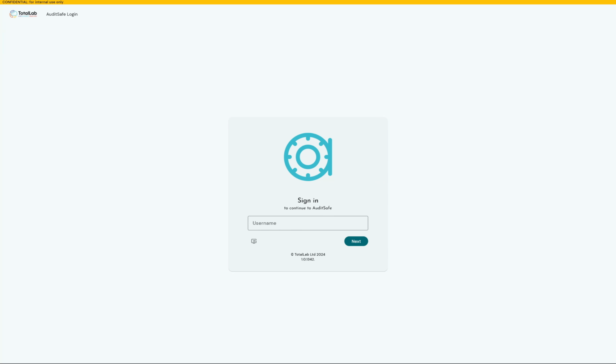As a brief theoretical idea of how AuditSafe works, AuditSafe keeps track of files. With application to Excel, it tracks CSV files: who accesses them, what's happened to them, how they've changed over time, things like that. But it doesn't track individual cell changes.